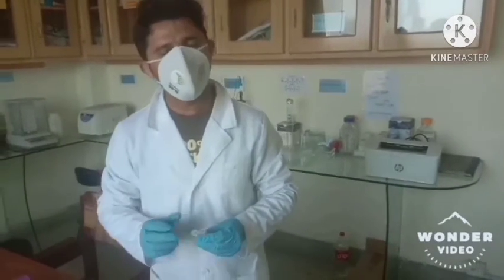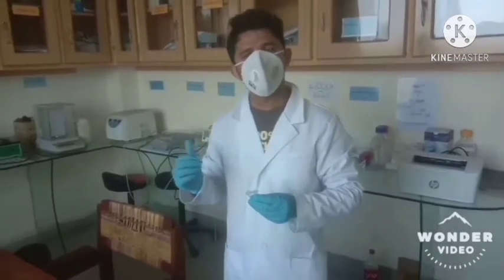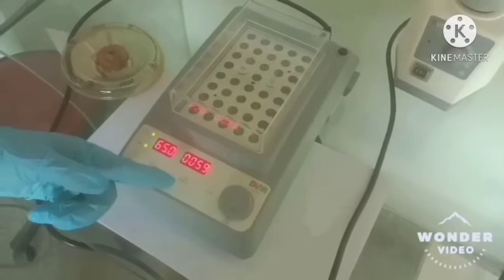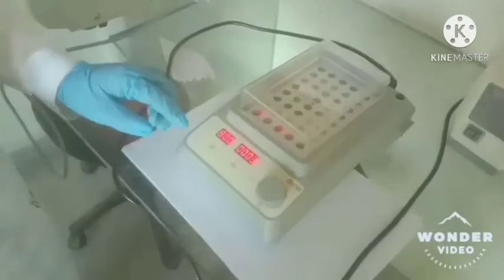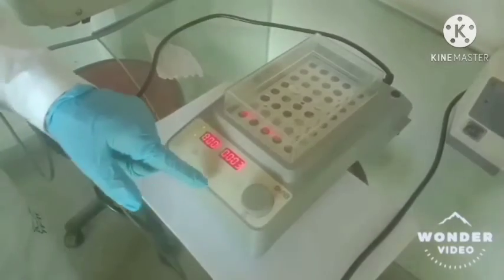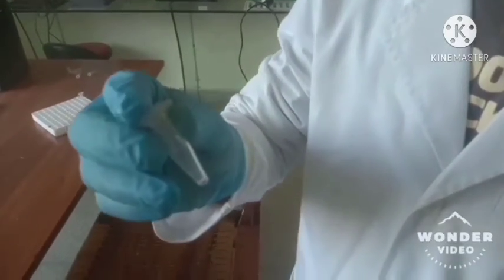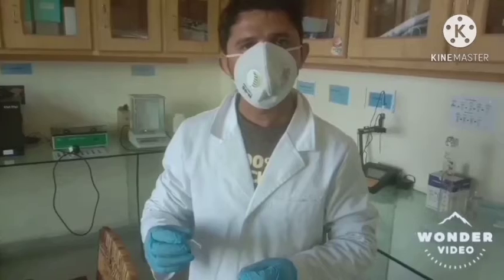We will place it into the hot plate oven for 1 hour at 65 degrees centigrade. After completion of the incubation step, we will stop the reaction at 80 degrees centigrade for 5 minutes. The results can then be visualized using a UV light system as well as gel electrophoresis.